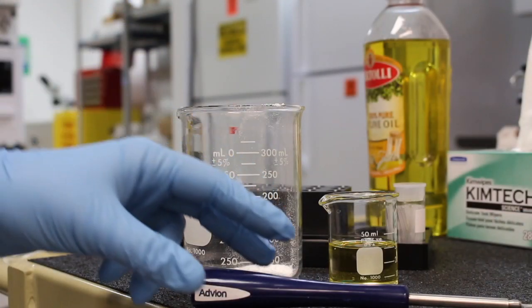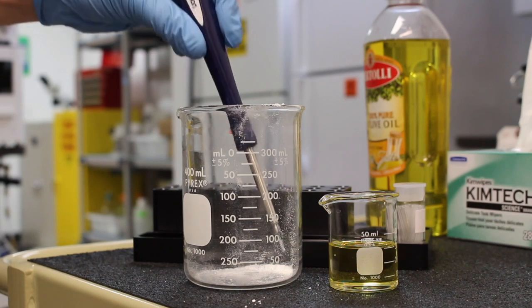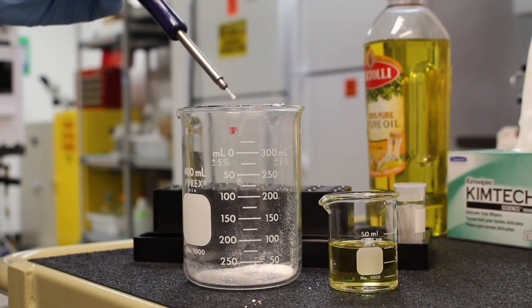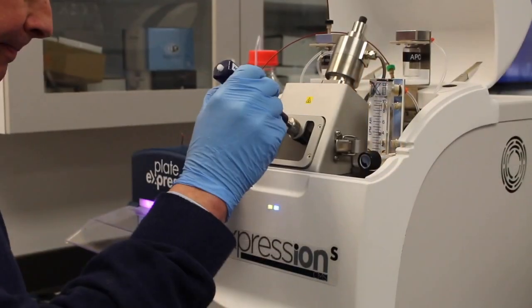Chemists simply dip the tip of the closed end of a glass capillary into the sample of interest or scrape the surface of a solid and then place the capillary into the mass spectrometer.